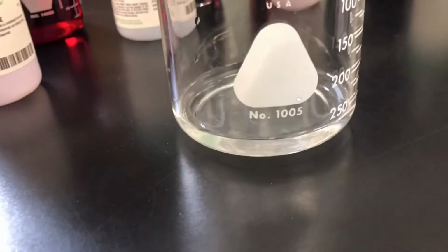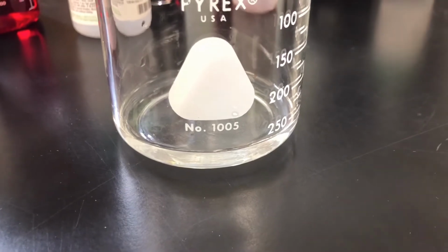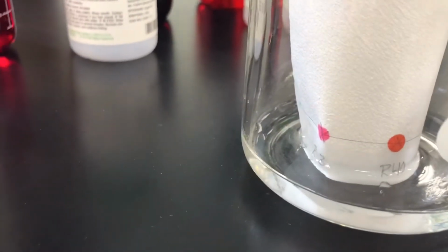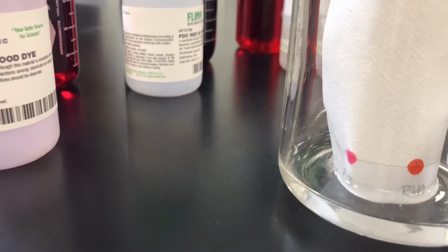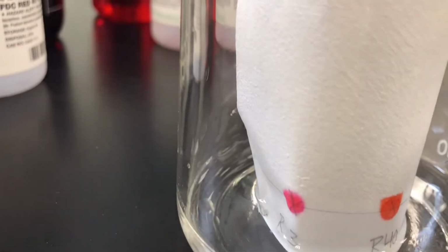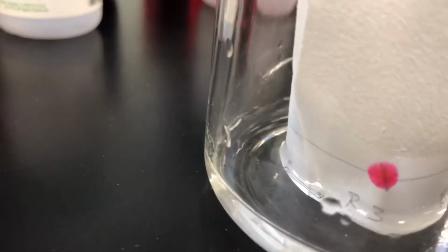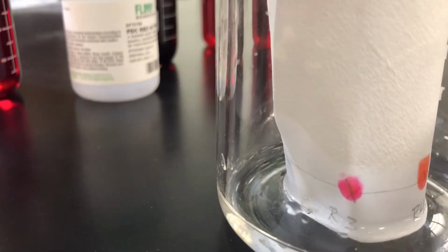I've got 25 milliliters of the 0.1% sodium chloride solution in here. I will place this in here, making sure that the water is not touching the dots. If it was to touch the dots, that material is just going to go out into the water and it'll be all over the place. So if we put our line too far down, that would be a problem. And so hopefully you're going to see here just in a moment that this water is going to go up, and the dye will start to move with it.